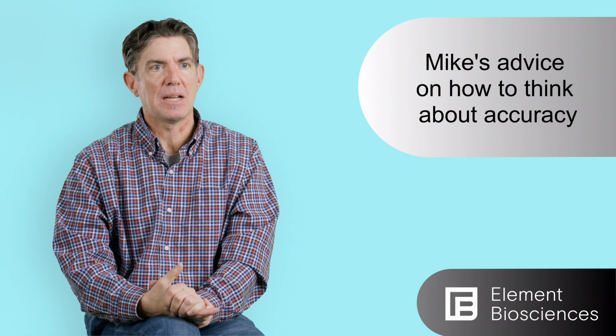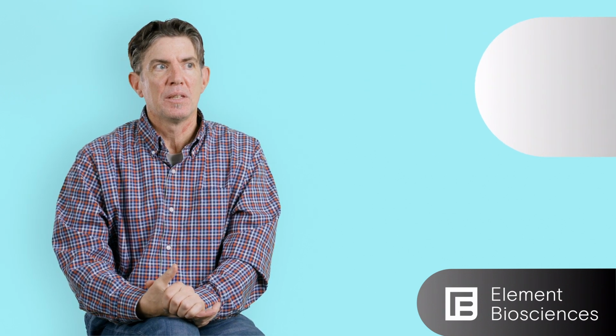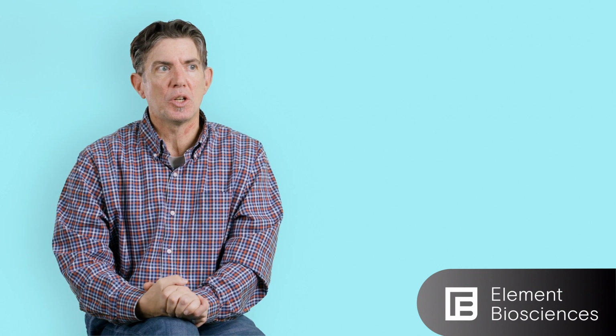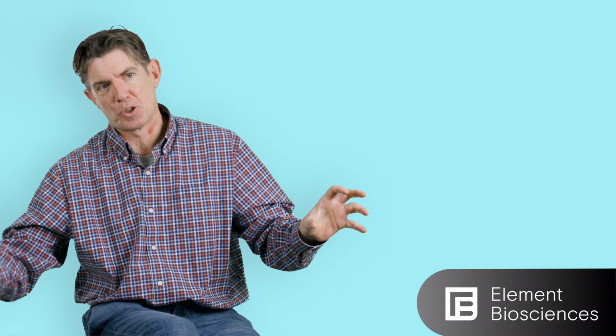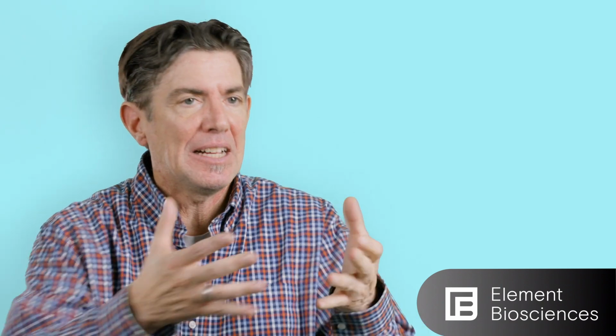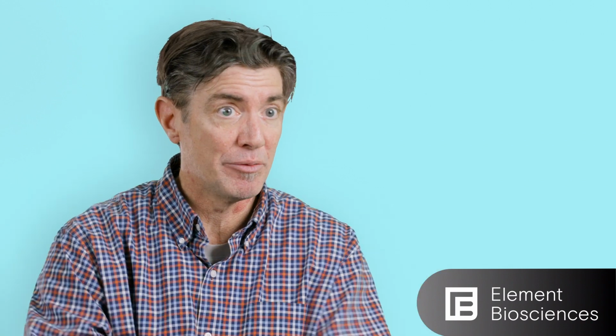The most important thing to understand about accuracy and how to think about it is that it requires you to understand your application. It also requires you to understand the things that you're using to prepare your sample and to interpret your data. It's not just the sequencing box that's going to get you to the holy land of the greatest accuracy and the greatest quality.